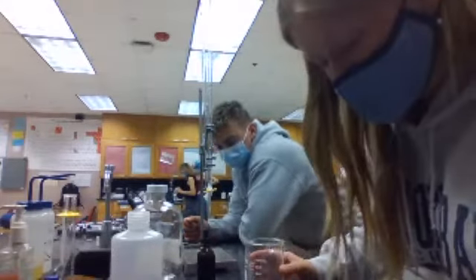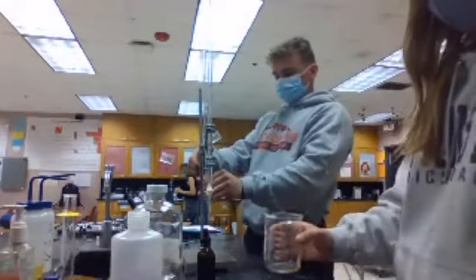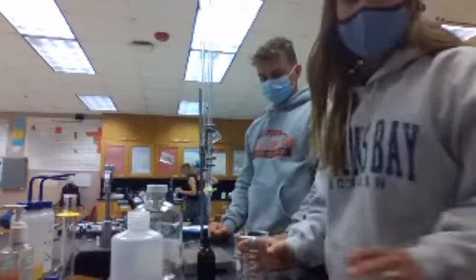So we're going to slow down at 8.47, but we're still going to check to see what time it turns blue. Okay, ready? Does someone have their graph out? Because we're going to start doing 1 milliliter at a time.